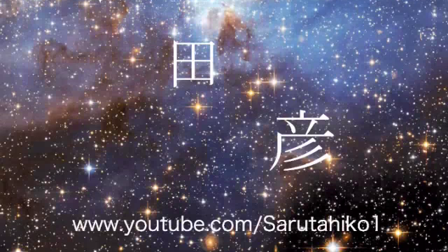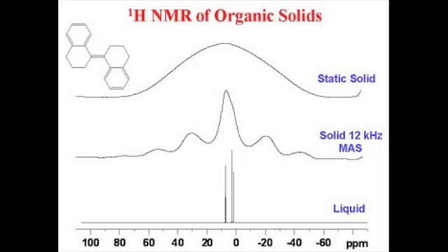So today I'd like to talk about NMR and more particularly about H NMR or proton NMR. And the reason I want to do H NMR and not carbon NMR is just for the reason that I actually think H NMR gives much more useful information than does carbon NMR. And we're going to get into a lot of reasons why that's true.